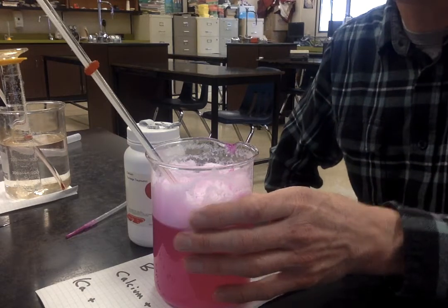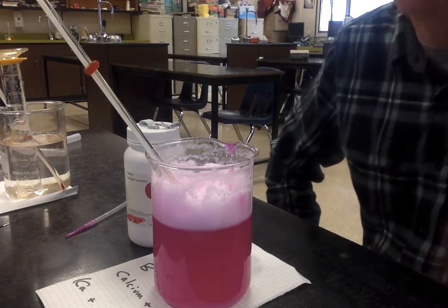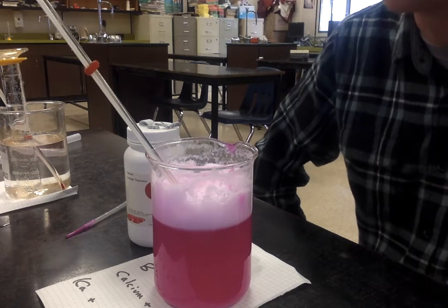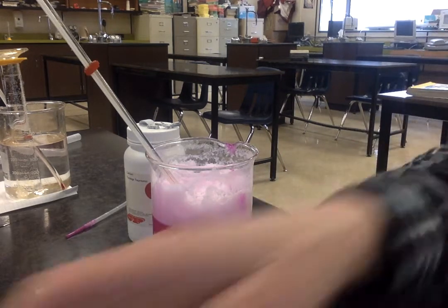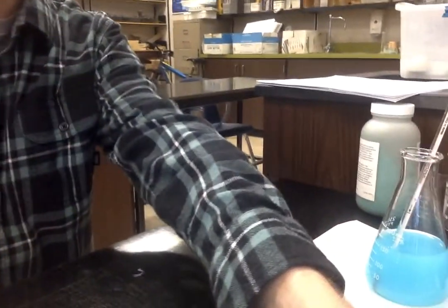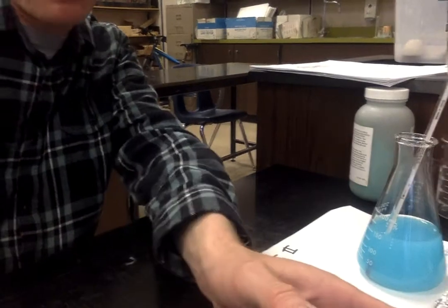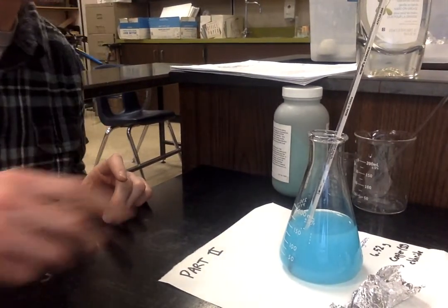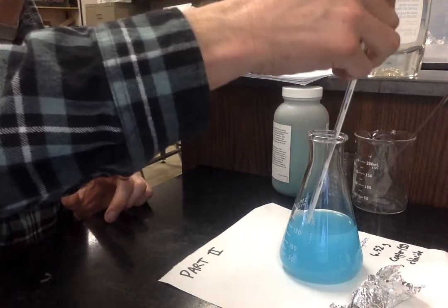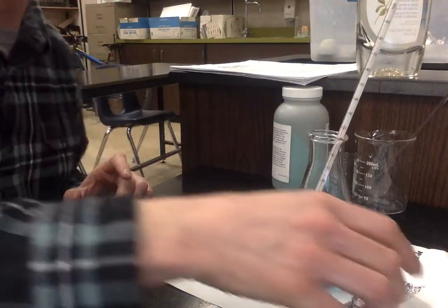When we see a color change, when we see a release of gas, this should always be considered to be evidence that a chemical reaction is happening. Now let's look at the next reaction, and I'll report those temperatures periodically when I have the time. This is our solution of copper chloride.